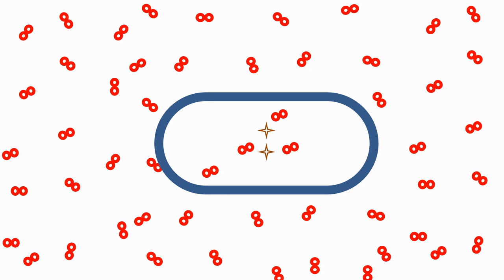Single electron transfer produces superoxide and transfer of 2 electrons produces hydrogen peroxide. These are more potent oxidants than oxygen itself and can bind to any iron available inside the cell, thus producing hydroxyl radicals. These oxidants and hydroxyl radicals can easily kill a bacteria if allowed to accumulate.